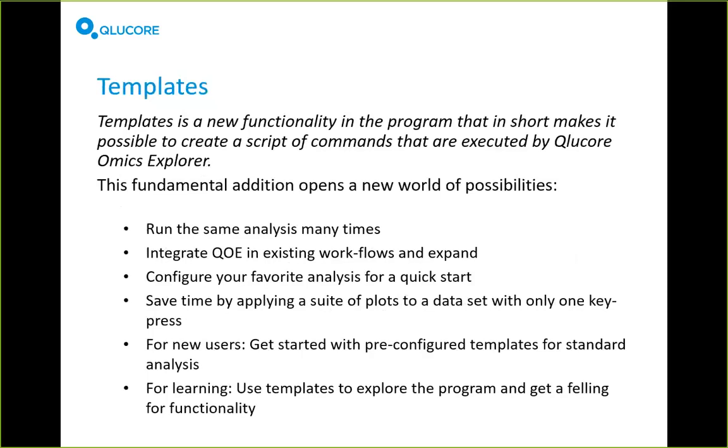Which means that I have no idea what people will do out there with this and what you'll build with this. This is a toolbox which is richer than maybe anything we've released so far. And just to sketch an idea of what you could do with it, you could invent lots of more things to do with this, but you could, for example, set up a template to run the same analysis many times.